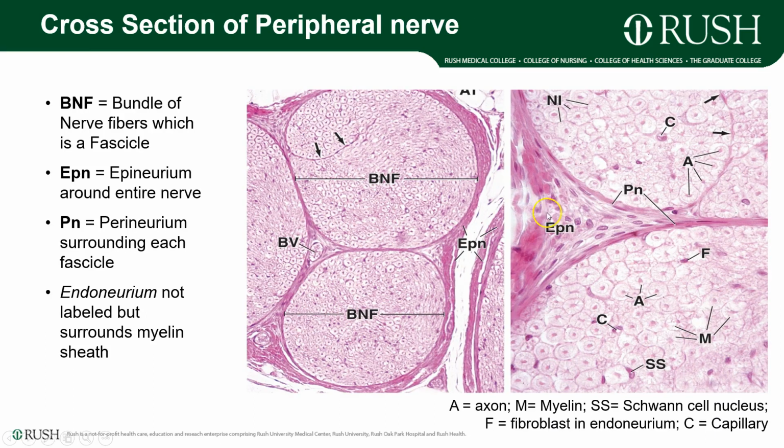This is a histological view, and you can see the bundle here of the nerve fibers within which you have individual axons. So if you look at the whole collection here, again going in a hierarchical way, you have the endoneurium, which isn't labeled here, surrounding individual axons, followed by a perineurium. In a higher view, you can see that is surrounding each one of these fascicles, followed by a hierarchical structure of epineurium, which is surrounding multiple fascicles, which are listed here, here, and here.